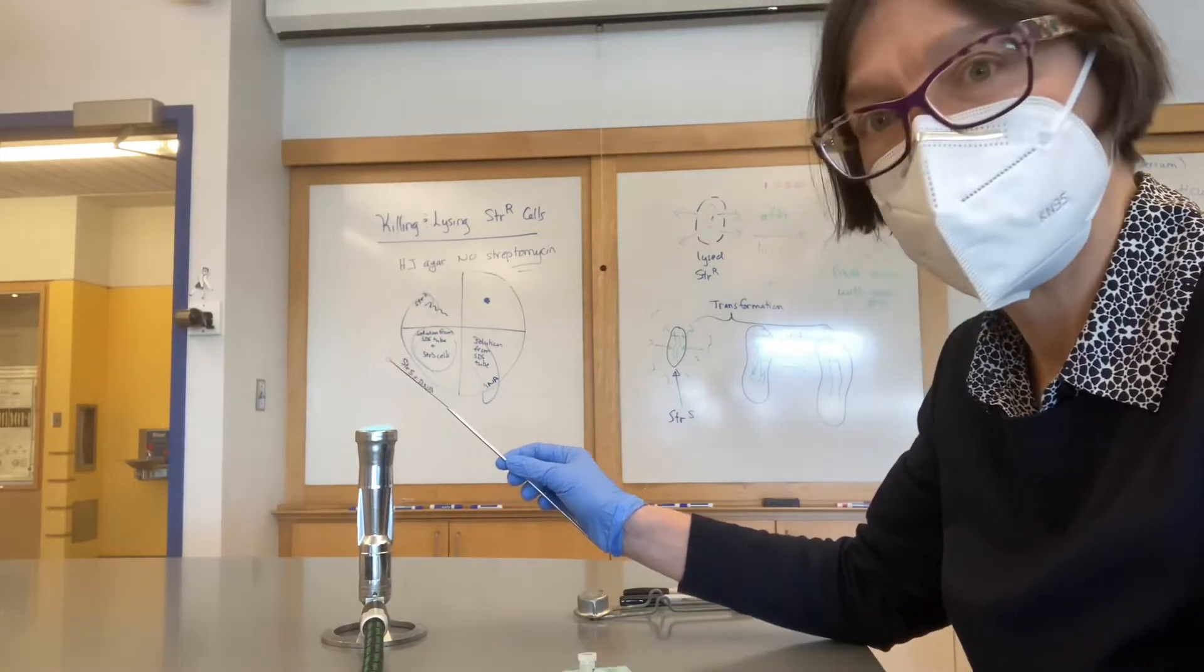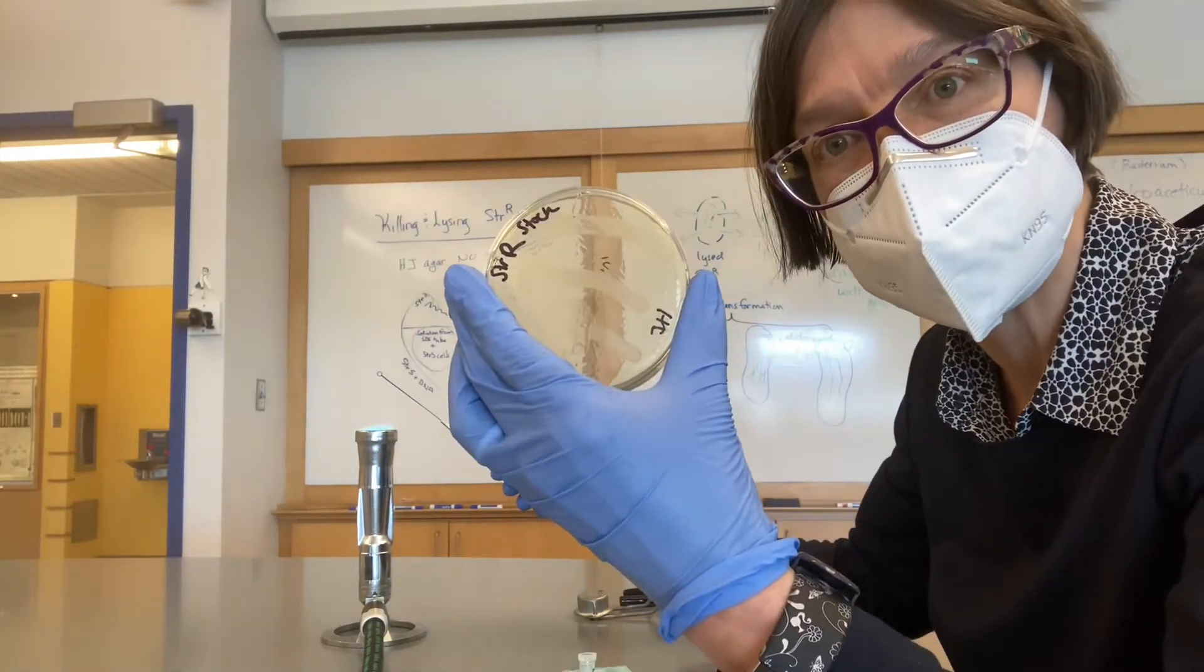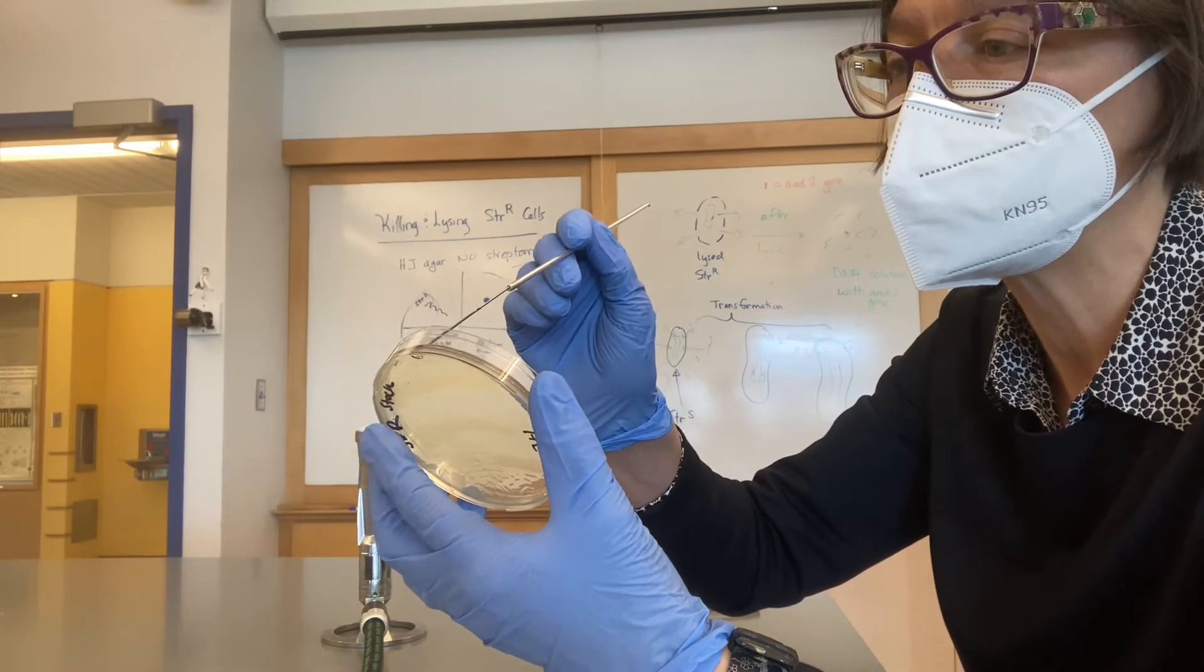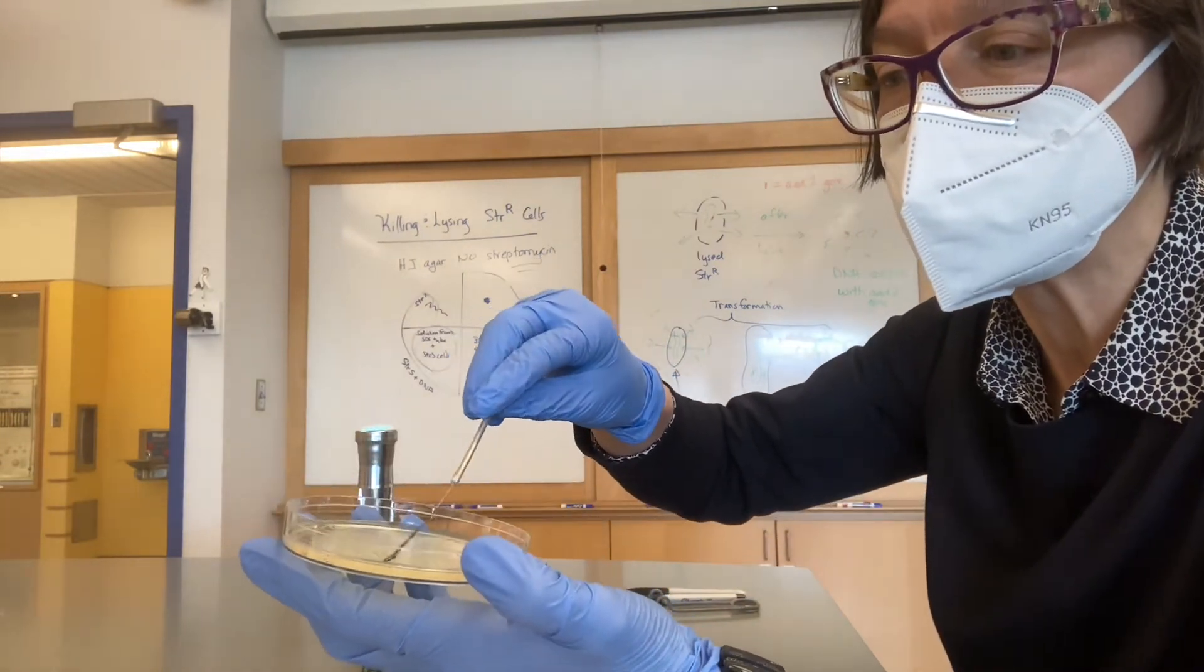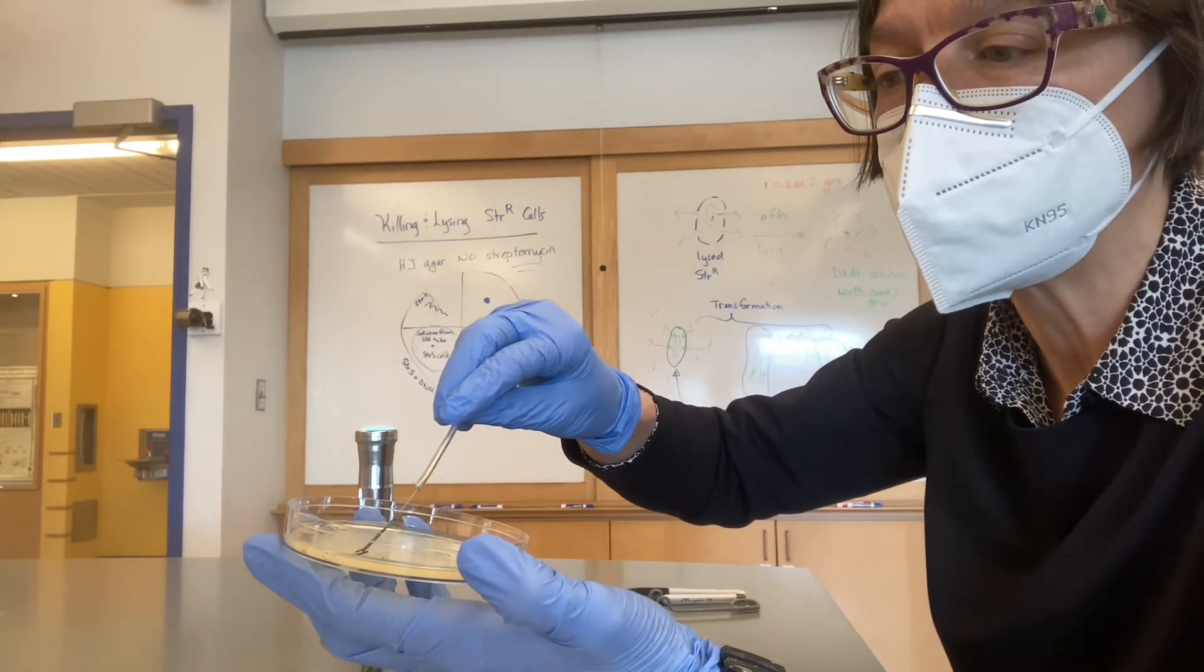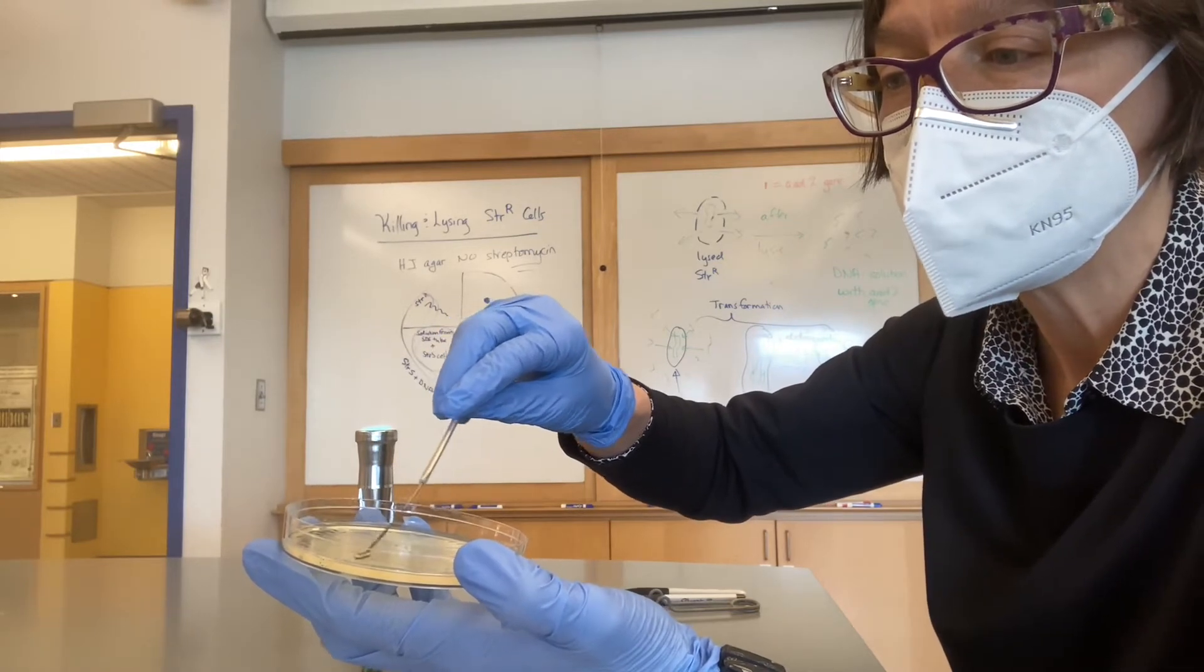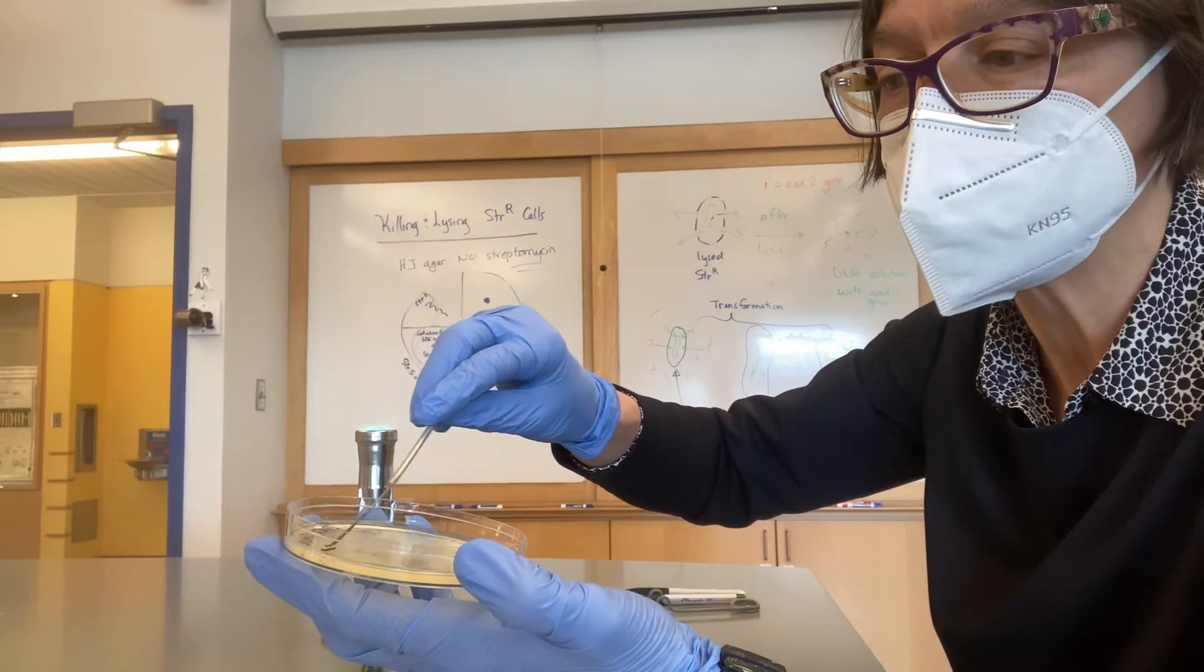Then I take my plate of STRR, cool the loop, and then I'm going to gather up some cells by scooping them up a little bit, a little ball of cells. A little goes a long way.